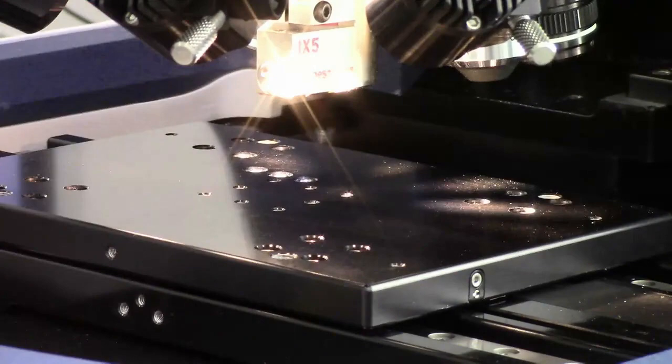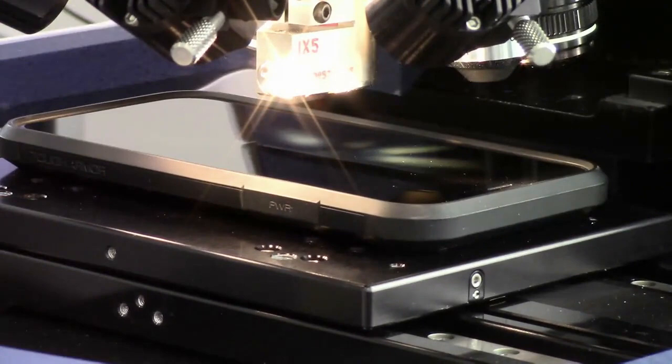So let's play a little game. I have my iPhone here, and we can measure the surface roughness of the screen. You can see it's real. It definitely turns on. And while I set this up to do the measurement, I want all of you to put in the chat, how rough do you think the screen is? So go ahead and do that. And while we do that, I'm just going to put it inside the instrument. It's a little bit dusty. All right. And also, I'm going to share my screen so you can see the software as well.